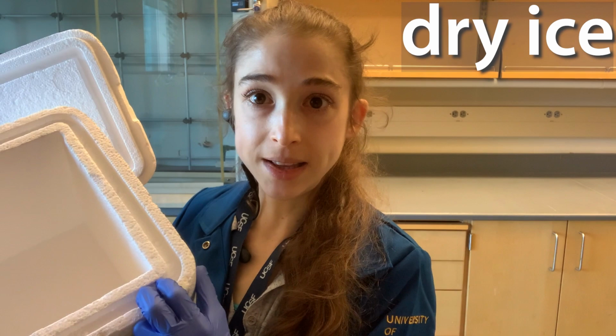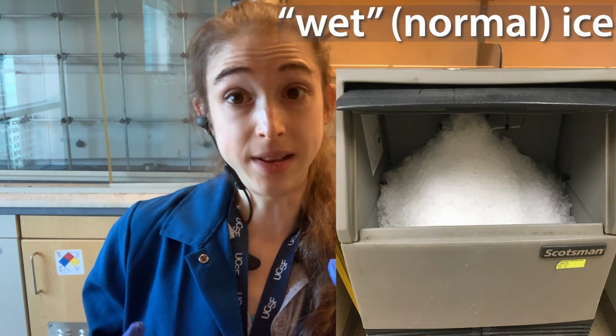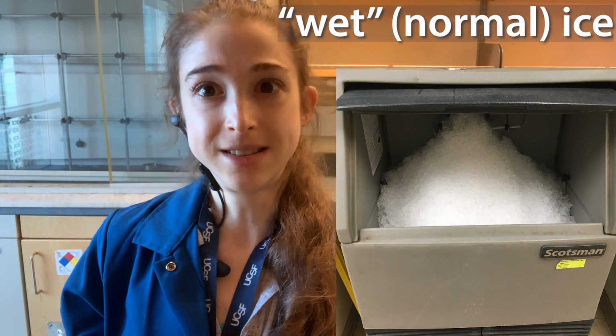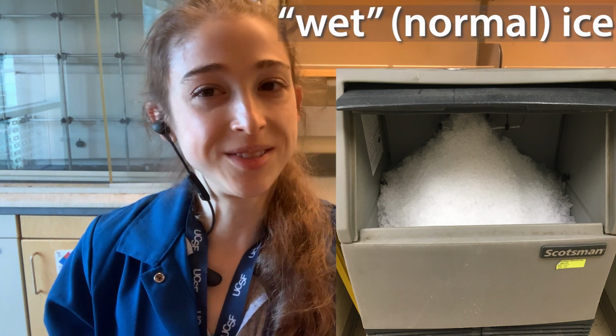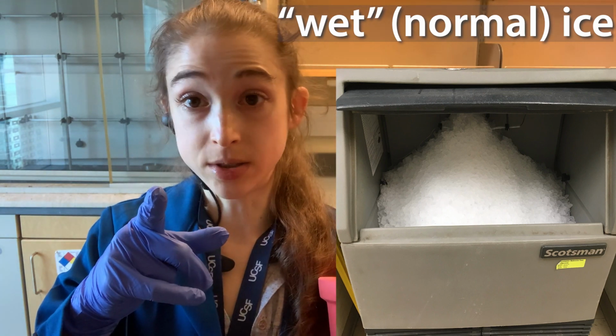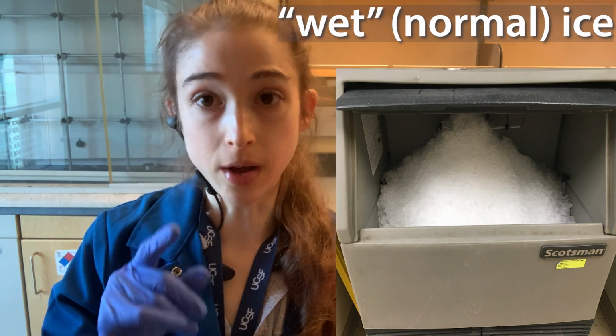And if you are shipping things, you can ship in a styrofoam container of dry ice. Now when it comes to wet ice, labs typically have, in the hallways, a shared ice dispenser, and if it gets hot in the summer, sometimes you see it gets really low. But make sure you're not that person that leaves the scoop in the ice. Don't be that person. People always do.